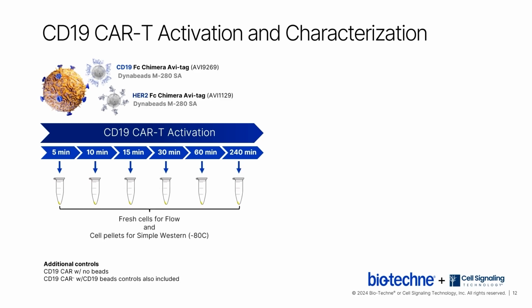We collected fresh cells for flow cytometry, and cell pellets were frozen to examine intracellular signaling molecules by Simple Western, using antibodies from Cell Signaling Technology. We also collected the cell culture supernatant at the 240-minute post-activation time point to confirm activation by secretion of cytokines.